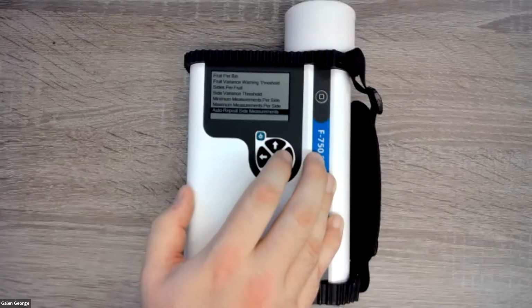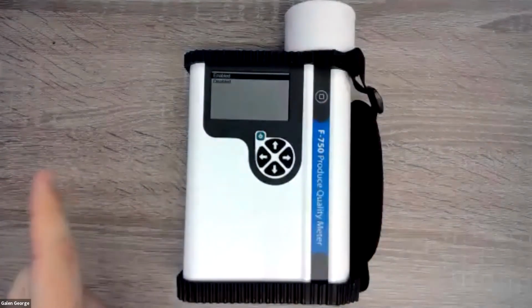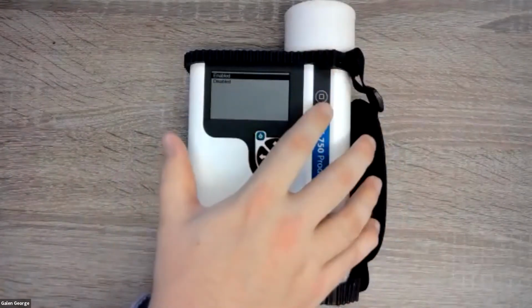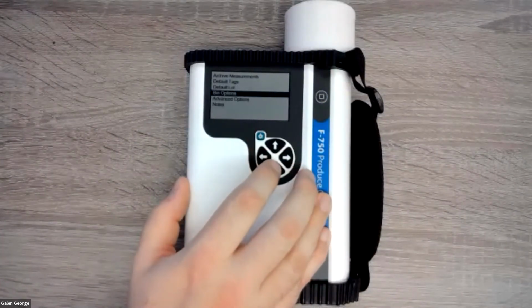And then what I had selected as yes, I enabled for the auto repeat measurement, so I only had to click once and it would auto repeat those measurements. But if you want to disable that, so you have to click the button every time, then you can obviously disable that feature. So that's the bin options.